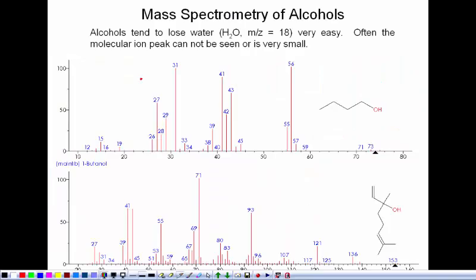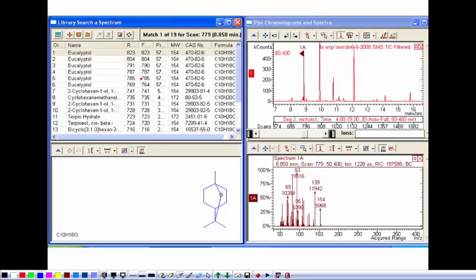So the important things about mass spectrometry, again, is you make the ions, you determine their masses, and the molecular ions break apart, so you get these fragmentations. We'll talk more in detail about the fragmentations next week and how you get them, because it's a good review of radicals and carbocations and drawing resonance structures. As we go through that next week, it fits in well with lecture. And then if you wanted to determine what the molecule was, you have the ability, if not to nail it down exactly, to at least narrow down your list.